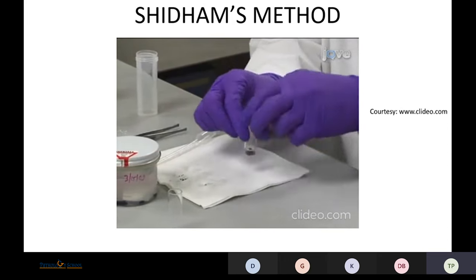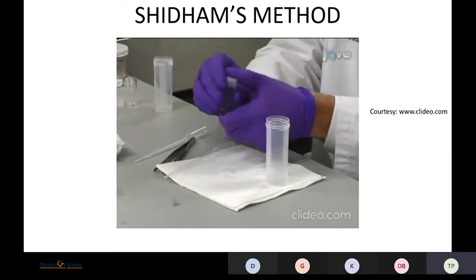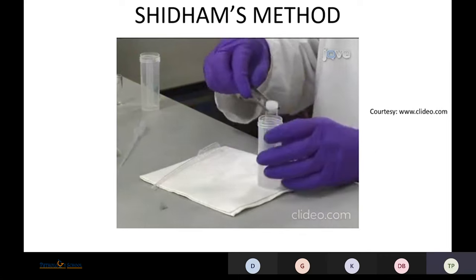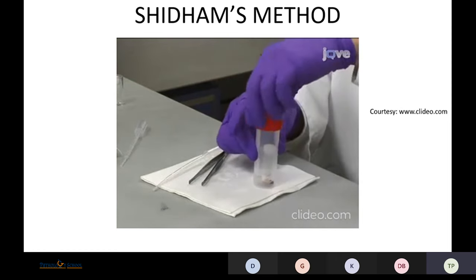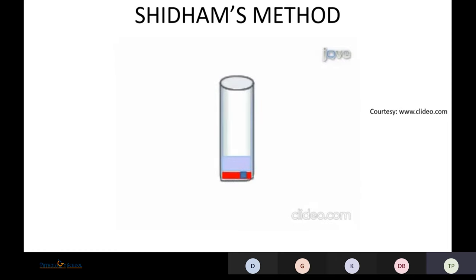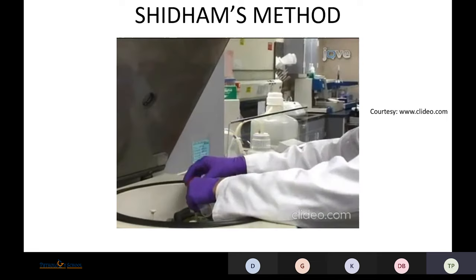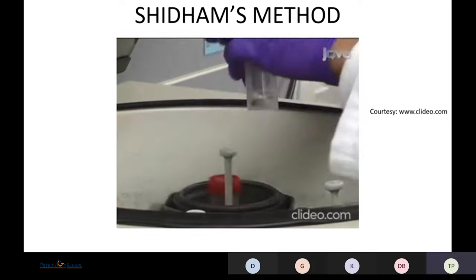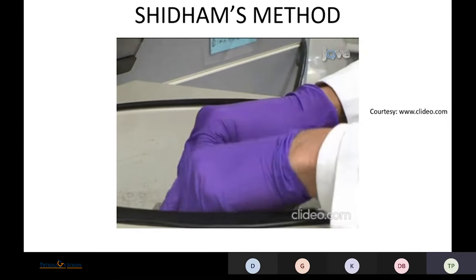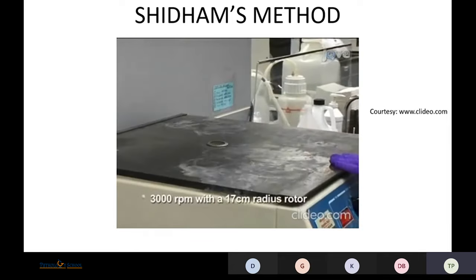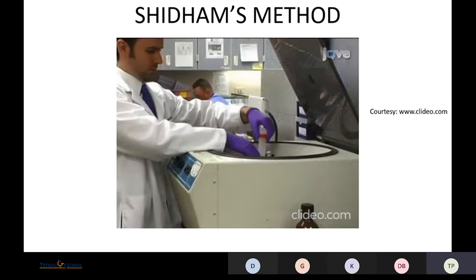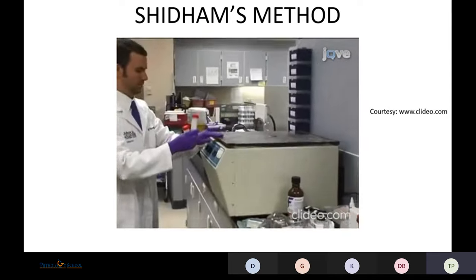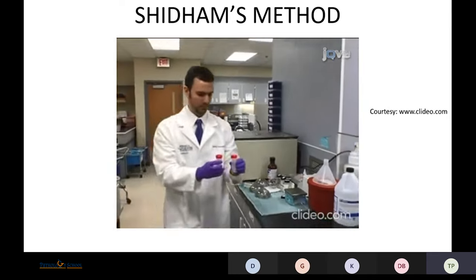Proceed immediately to adding about 2.5 ml of warm water at 45°C to the carrier plastic tube, then insert the capped glass tube containing the cells, AV marker, and histogel. Working quickly with warm water prevents the gel from solidifying during subsequent steps. Next, centrifuge to push the AV marker through the gel and concentrate the cells into a layer closer to the cutting surface of the final paraffin-embedded cell block. Use swiveling cups — not fixed angle cups — so that cells concentrate perpendicularly to the flat bottom of the glass tube. Spin at 1800 g for five minutes at room temperature. When centrifugation is complete, remove the tubes gently and vertically from the centrifuge, taking care not to disturb the thin sediment layer at the bottom.